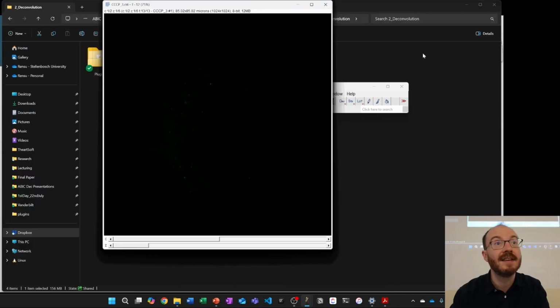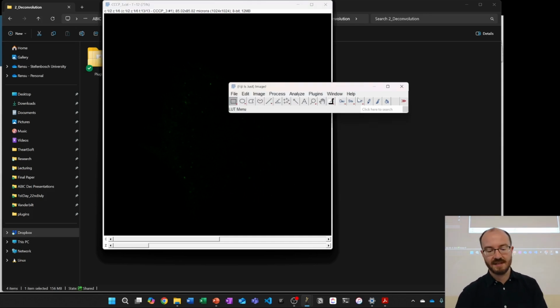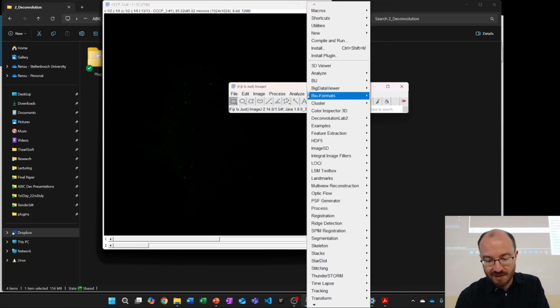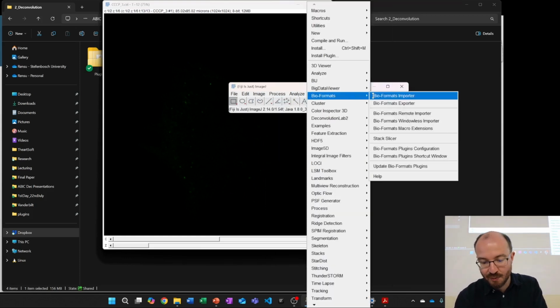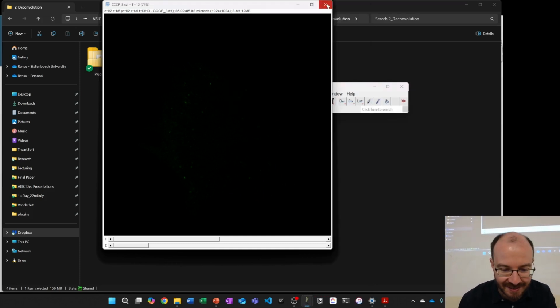So basically that menu that you showed before when you said open. Yes, that's automated. That macro would have automated it so that I don't need to go to plugins and then Bio-Formats Importer. The problem is if you don't go to this plugins Bio-Formats Importer and you just in Fiji open up the file directly, you don't get the right macro code of all of those extra features and things that you selected. But okay, so now I've got these different time points.